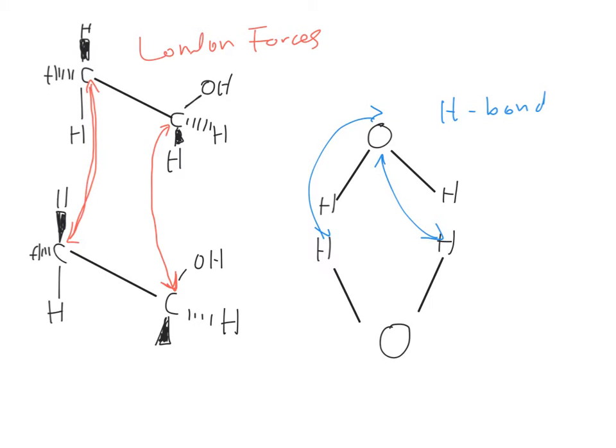So the physical change that boiling creates is simply a change in phase. This goes from a liquid to a gas, and this will also go from a liquid to a gas, but ethanol will break sooner, so it'll turn into a gas quicker than water will.